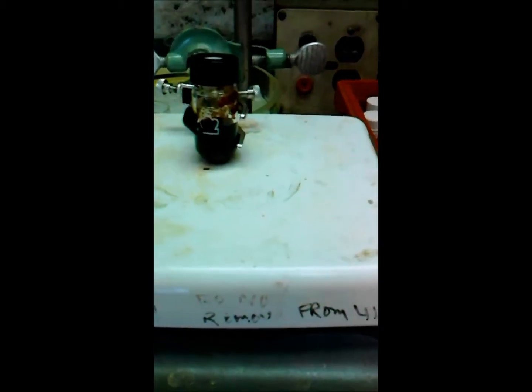Alright, so the reaction's been stirring for another 30 minutes at room temperature. It still definitely looks dark reddish purplish.